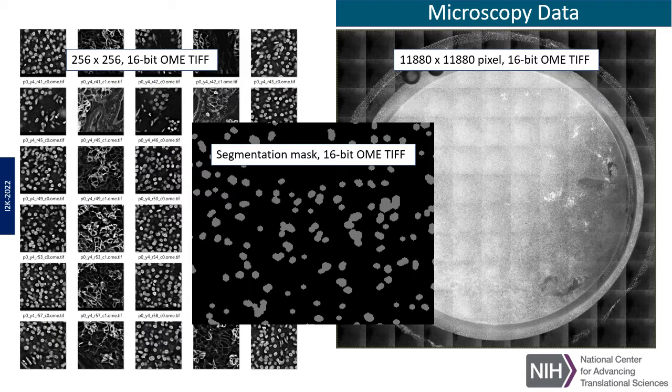They come from two acquisition modes, recording data into separate channels: the nuclei channel, typically a blue fluorescent DNA stain, and the cytoplasm channel, the cell membranes. Not all the image content is informative. The essential part is taking place in cells, so you can see a cell segmentation mask in the center of the image. Segmentation precedes feature extraction.